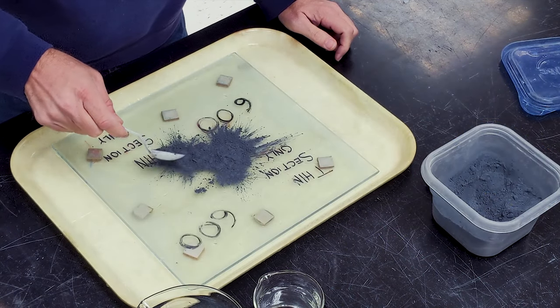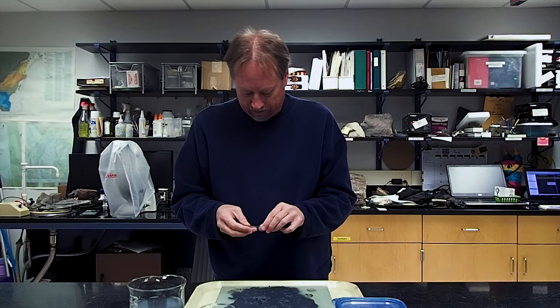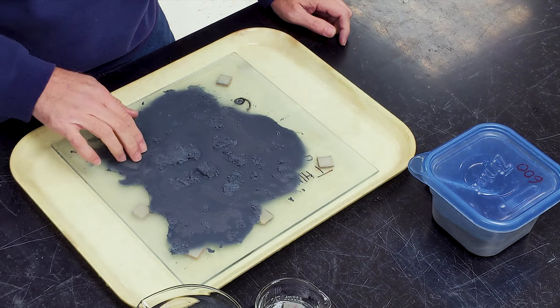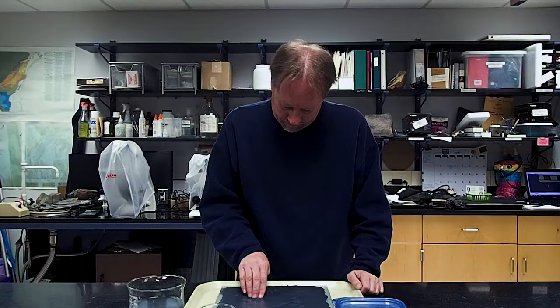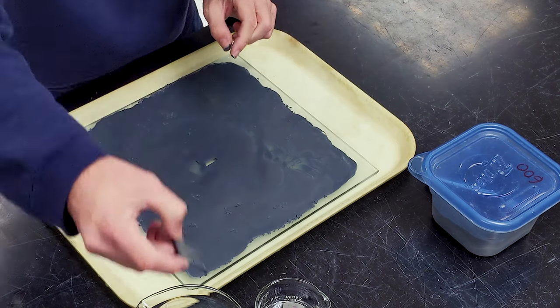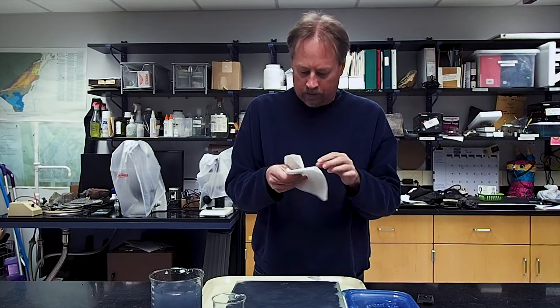Once you've reached the 600 grit size, in addition to polishing your rock chips, this is also when you should frost your slides. Using the same technique to polish the rock chips, simply work the glass slide around the glass plate until you've achieved an even and frosted glass surface. Rinsing off your slide and drying it off will allow you to see whether it has been evenly frosted or not.